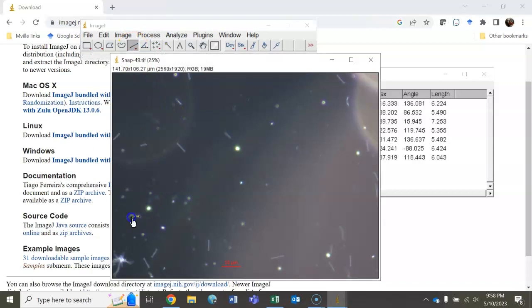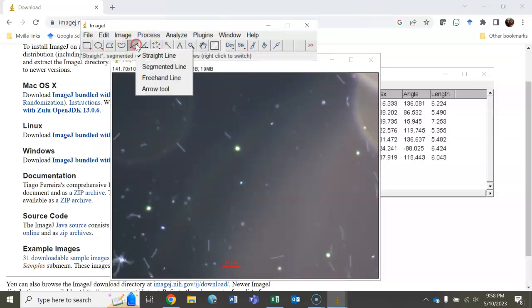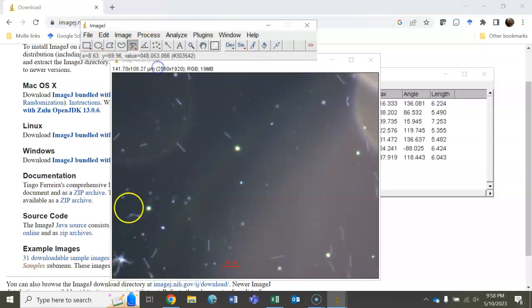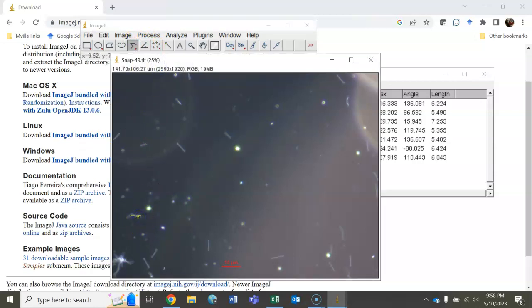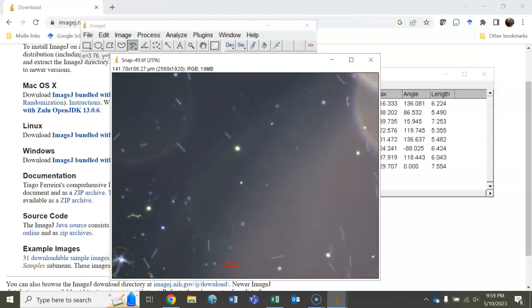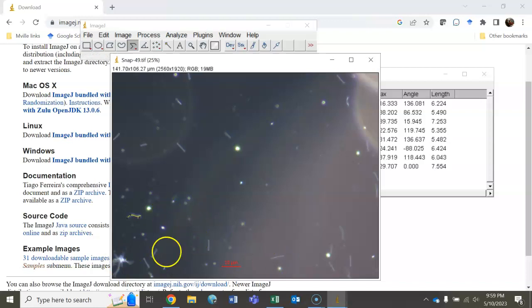Now, it does that weird angle move, so I can't really get a good measurement using the straight line. But if I right click here, I can go to a segmented line or a freehand line. In this case, I can just do clicks to get to the end length and then do a measurement that way. Down here at the bottom, this is almost like a biofilm formation, a bunch of spirochetes all stuck together. We wouldn't measure that at all. If we don't see spirochetes or cells that are separated, we'd be concerned that maybe we're not getting the actual measurement of that cell.